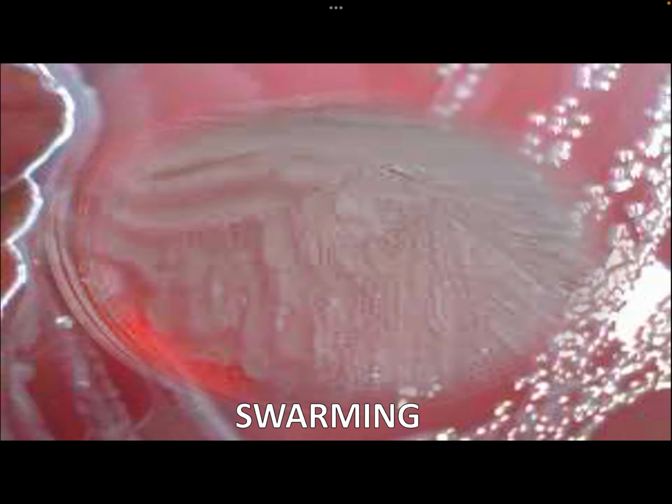Another one. What is this? So there it is. That's the swarming of Proteus. That's why the colonies are often overlooked, because the swarm covers the colonies. So if you really want to isolate the bacterial microorganism, to pick up the colonies and to inhibit the swarming, the example that I have given you is the use of trimethoprim lactate. Also this one, that is swarming. You can see here swarms of Proteus.